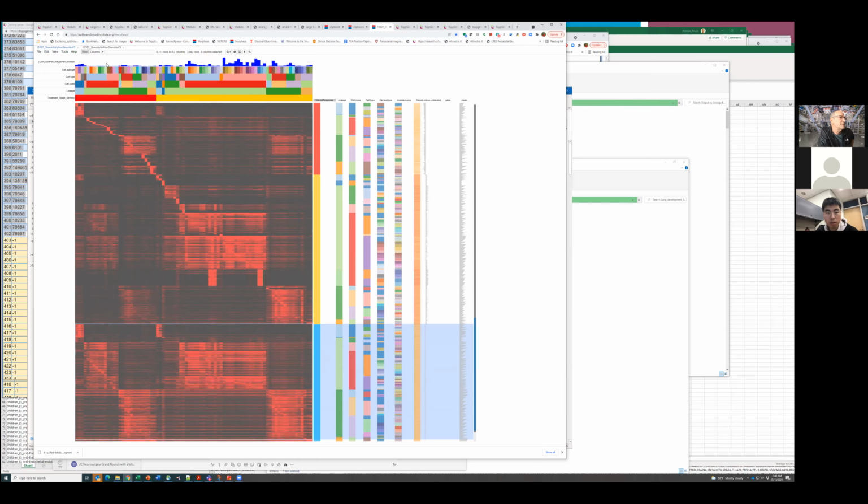At the top is a count of the number of cells in each of those classes. We're still fiddling with a better way to depict that. The principal problem is normalizing the cells between different sample groups so that we can see the proportional changes. Anyway, here's the raw data about the counts of those cells and types, and it's going to look even better once we normalize it. But anyway, there are a couple of things to consider.